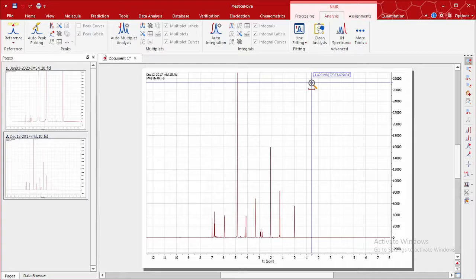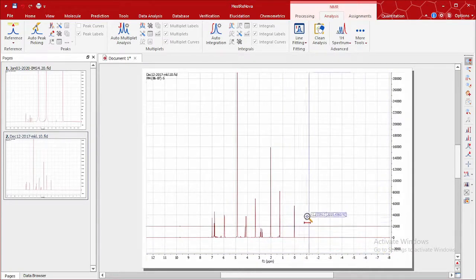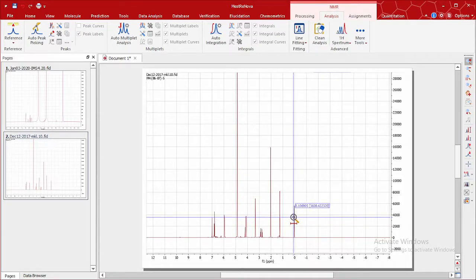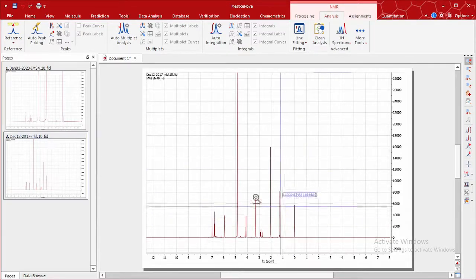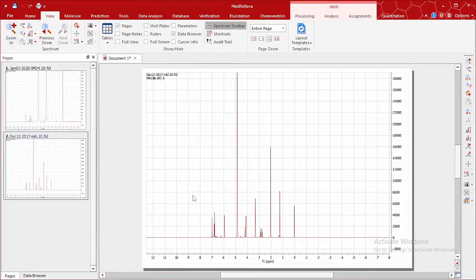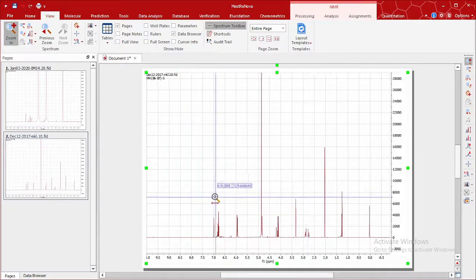The first thing is, how do we know that this is a Proton NMR? This is a Proton NMR because, as we can see, the peaks start from 0 and end at 12. The 0 peak you see corresponds to tetramethylsilane. The range for Proton NMR is 0 to 15, and if it's a carbon-13 NMR, you see it from 10 to 220. For me, I like zooming into the exact file so I am able to see everything clearly.